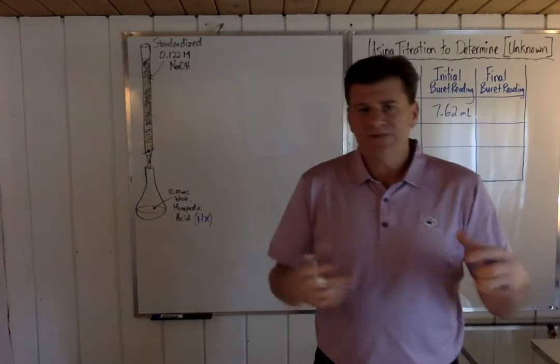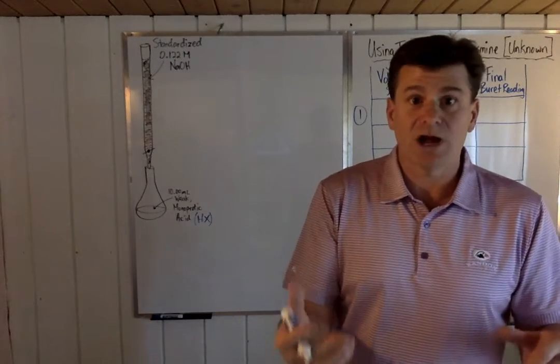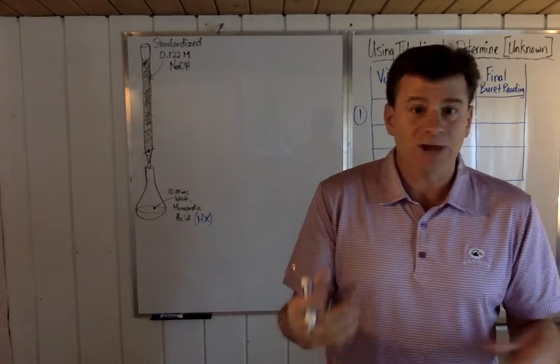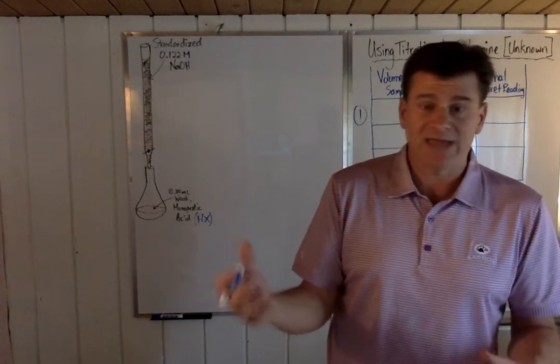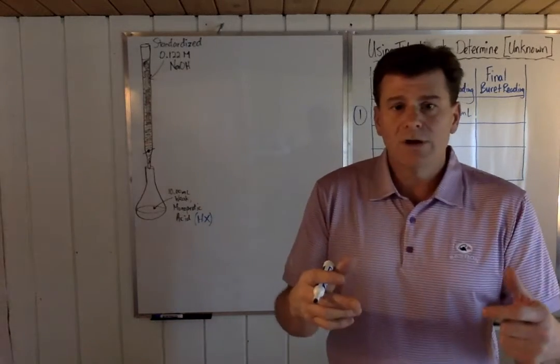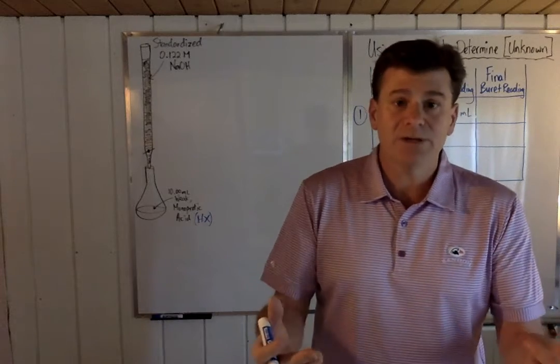So I would have taken some of the solution and poured it into a clean and dry beaker, because concentration is vital here, so I can't alter the concentration of the acid as I'm transferring it from one place to the other. So I take a sample of my acid in a clean, dry beaker.